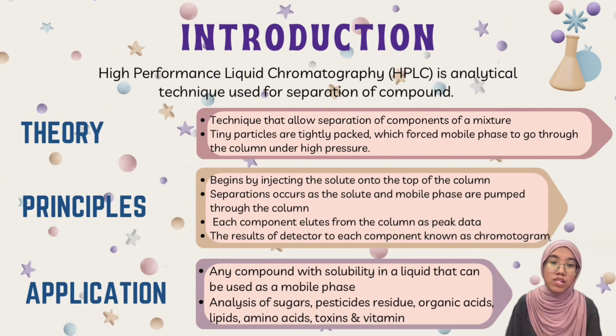Next, the principle of HPLC. It will start with injecting the solute on top of the column, and separation will occur when the solute and mobile phase are pumped through the column. Then the separated components will elute as peaks on the result known as a chromatogram.